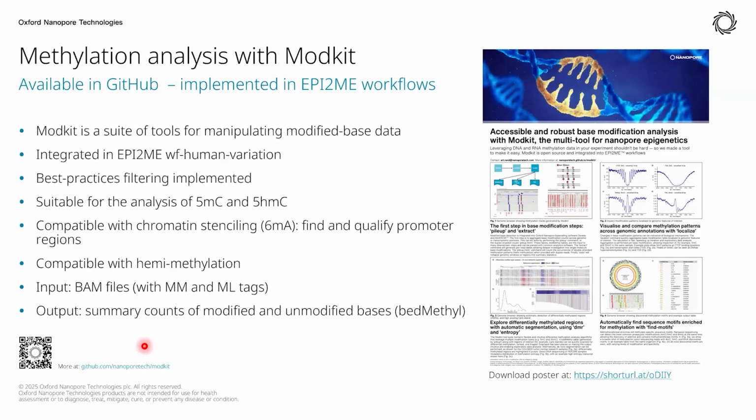And that can be useful for some third-party software where they're looking for data in specific formats. You can always convert it. BedMethyl is a standard file format. It's essentially a bed style format with tab delimited columns. And you can always convert that as needed to other formats, based on what kind of tools and software you want to use.